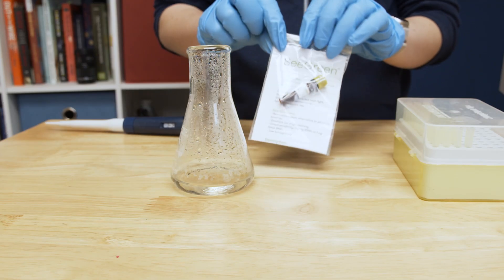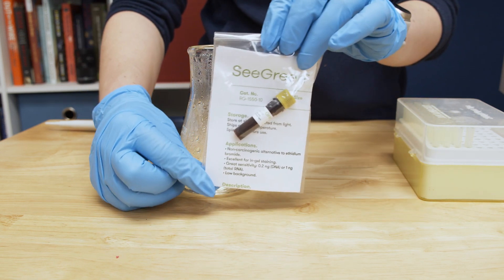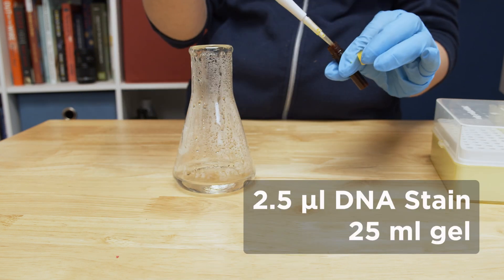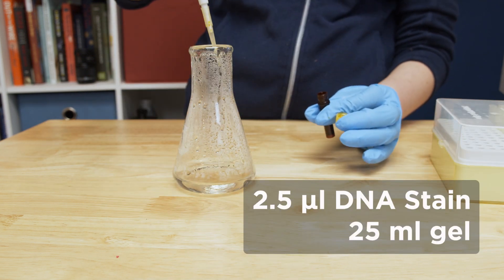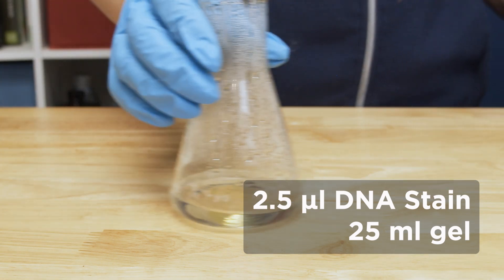Once your agarose solution is dissolved, add one microliter of a fluorescent DNA stain, like Sea Green or Gel Green, for every 10 milliliters of gel. Here, because we made a 25 milliliter gel, we will add 2.5 microliters of fluorescent DNA stain and swirl to mix.